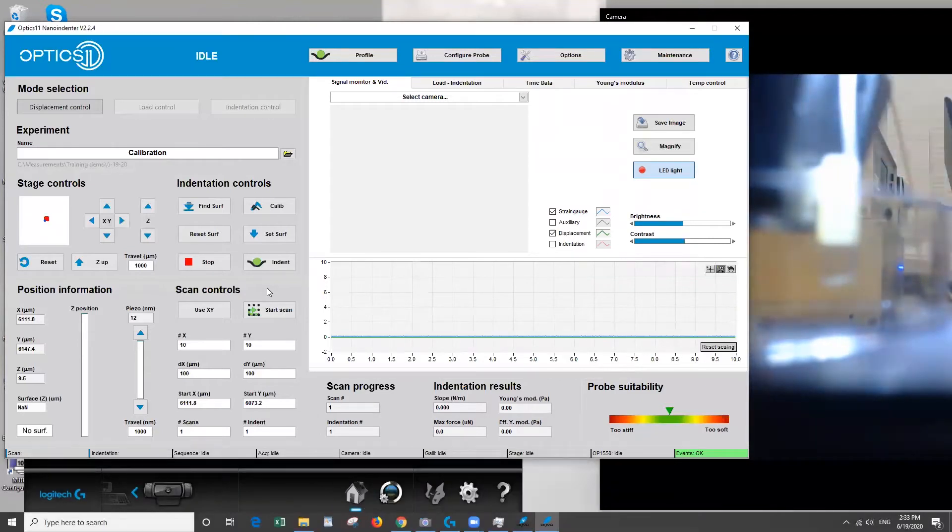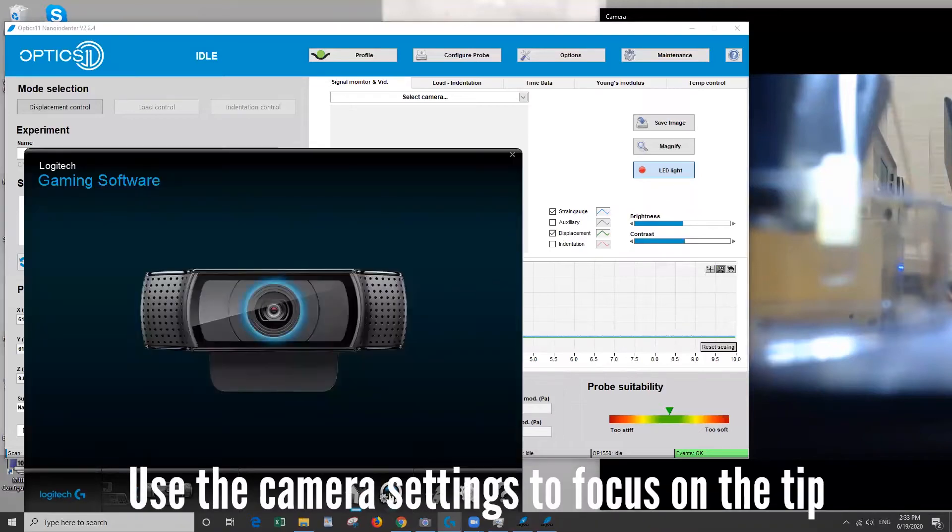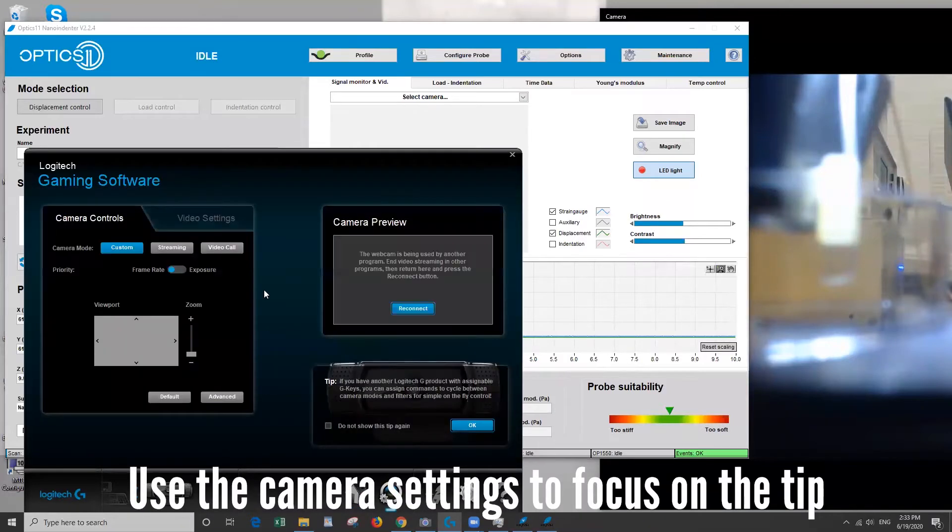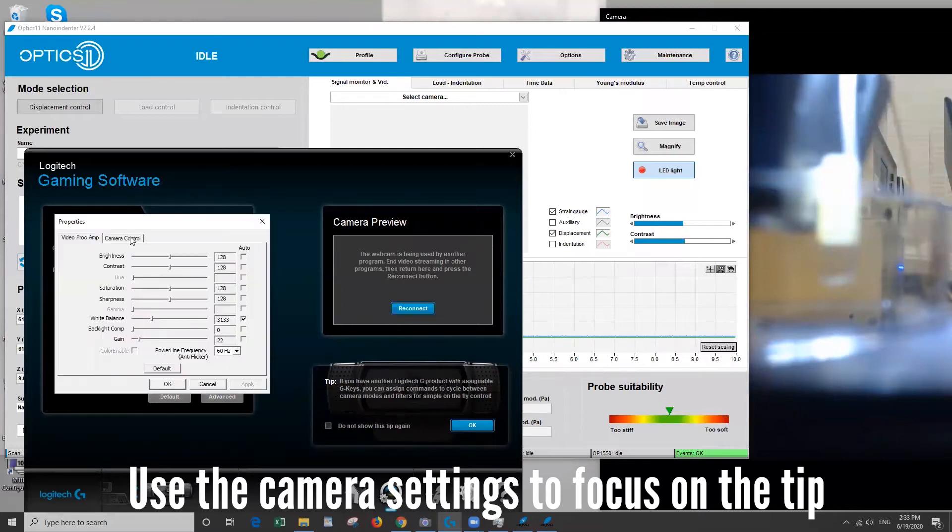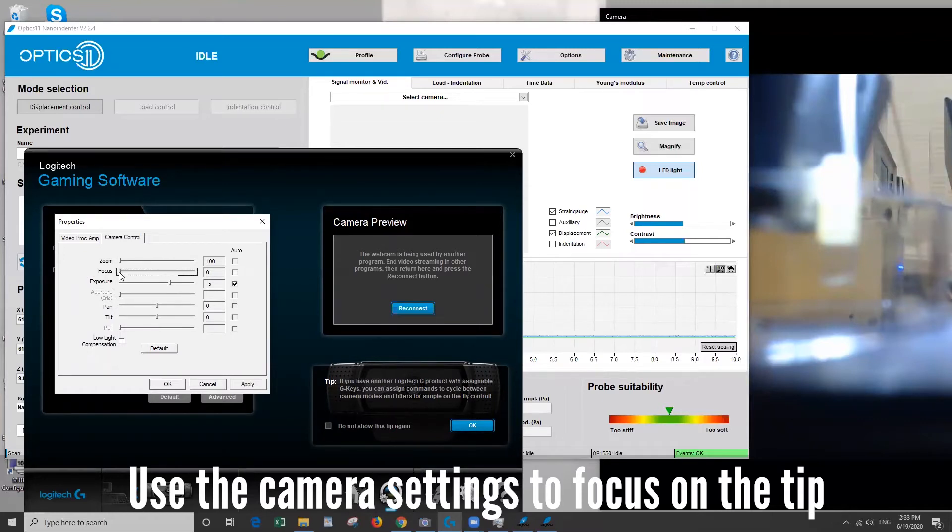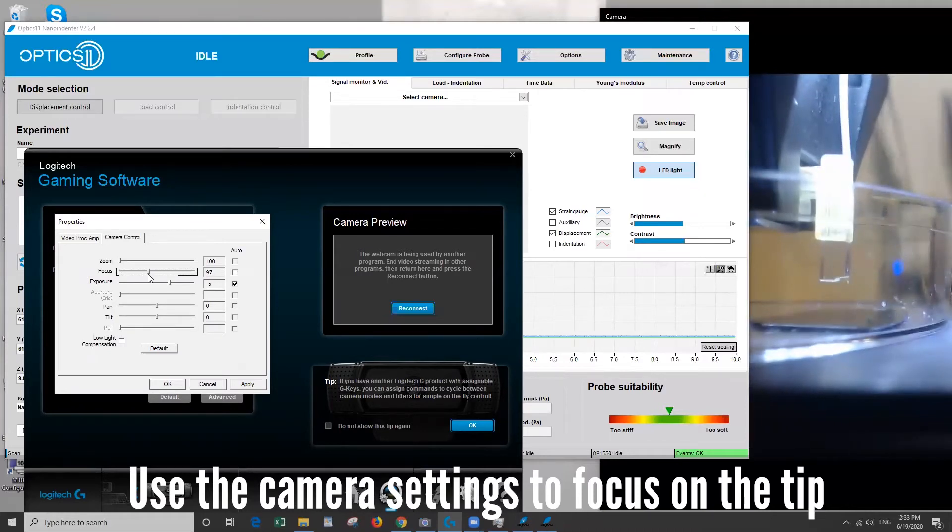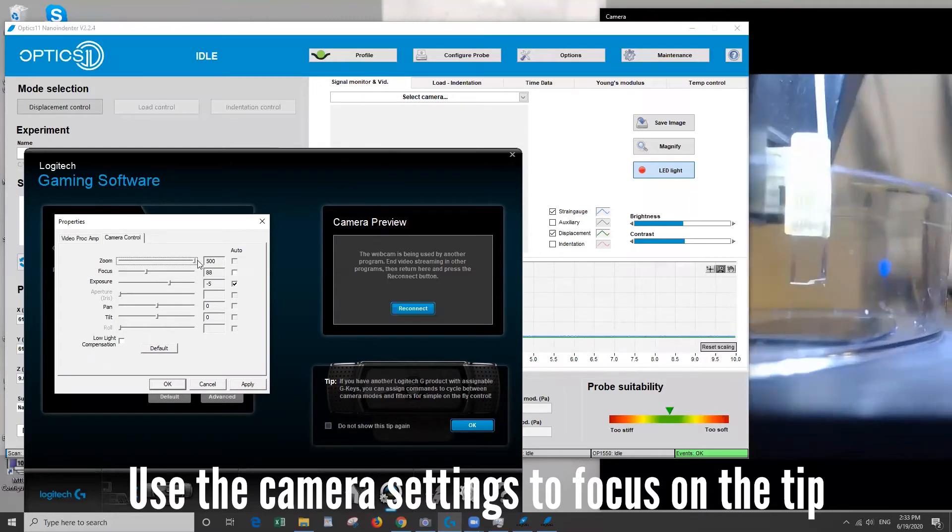And you can see that it's blurry and that's why we need to use the settings here. So if you click on this button it'll open the settings. We go to advanced the camera control tab and uncheck auto focus and then use the slider to bring the tip into a good focus. You can also use the zoom to help you out if you want.